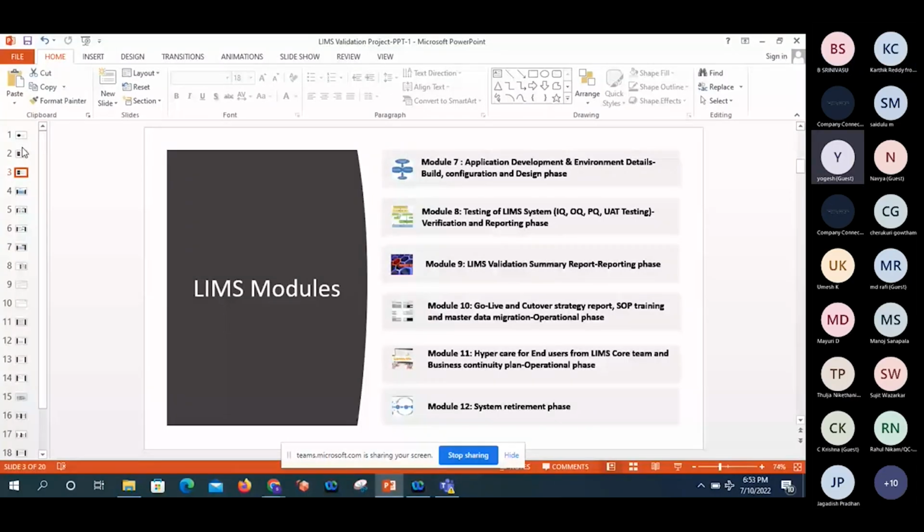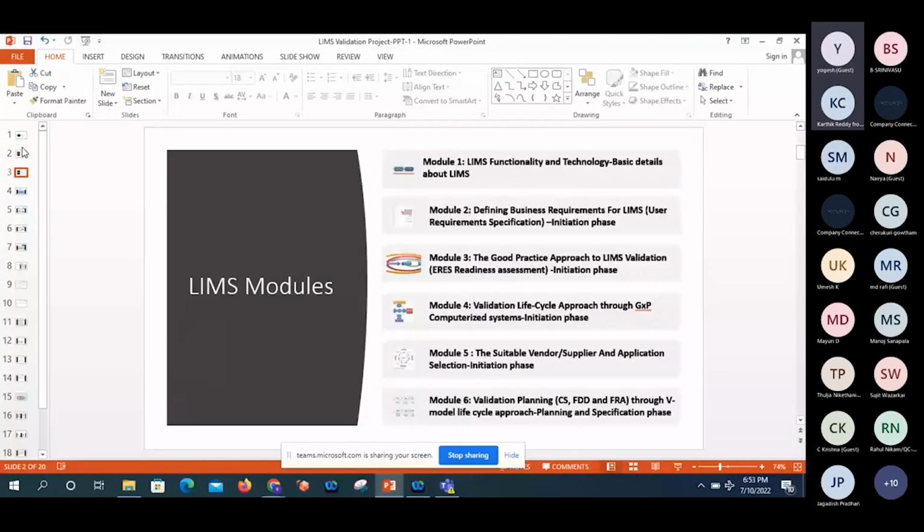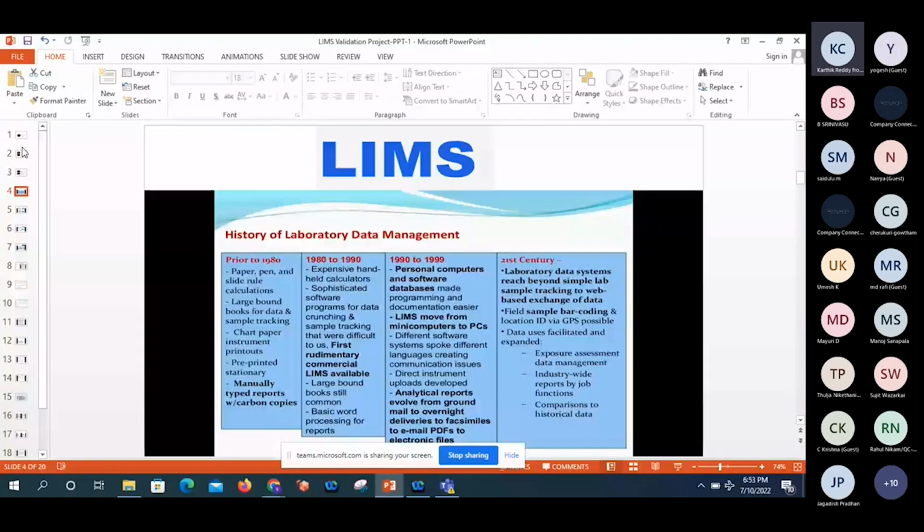So in this course, you can cover the ERP LIMS interface. Yes, I will explain the general things: how the inspection plan will be generated in SAP, and how it is integrated with the PI process engine. After that, to LIMS. Once the lot is generated from SAP to LIMS, there is also post utilization, so the COA will be directly triggered to SAP. I will explain what procedure is available in the current industry.